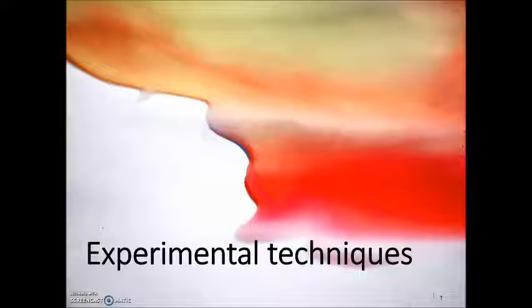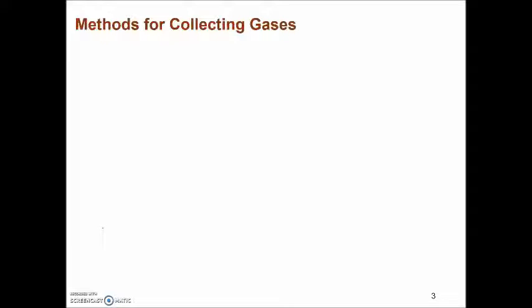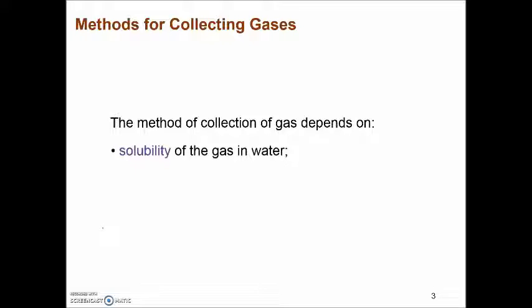Welcome to the topic of experiment. In this topic, we will be learning about two types of techniques: methods for collecting gases and methods to purify and separate mixtures. Now, there are various methods for collecting gases, and the method depends on how soluble the gas is in water and how dense the gas is compared to air.